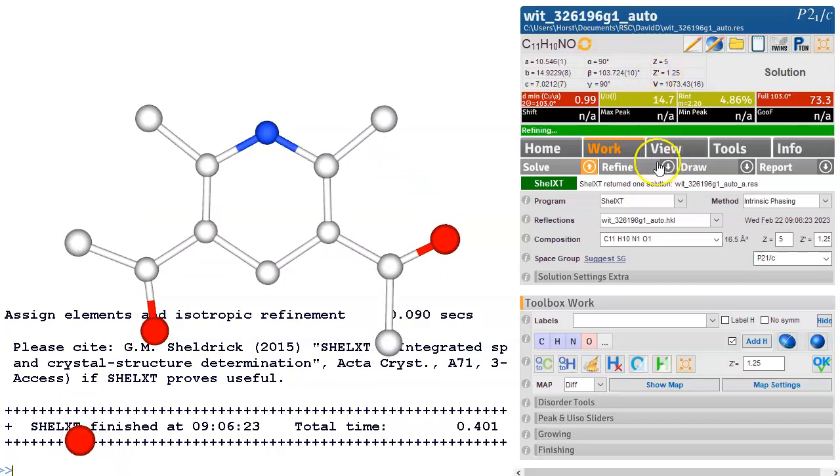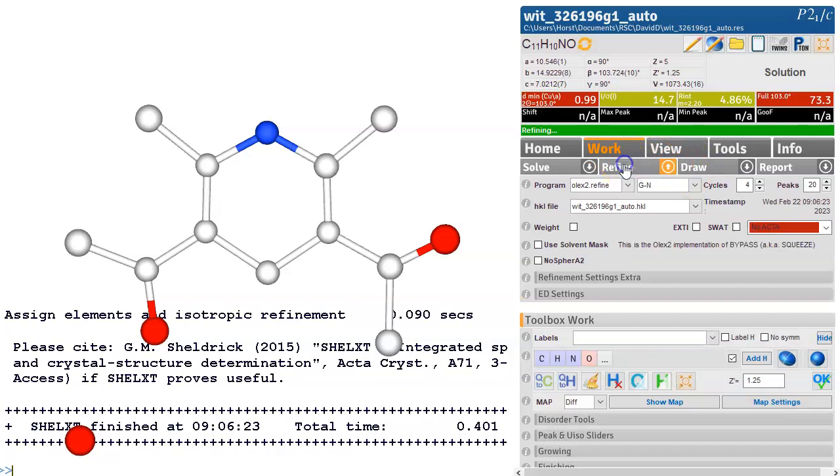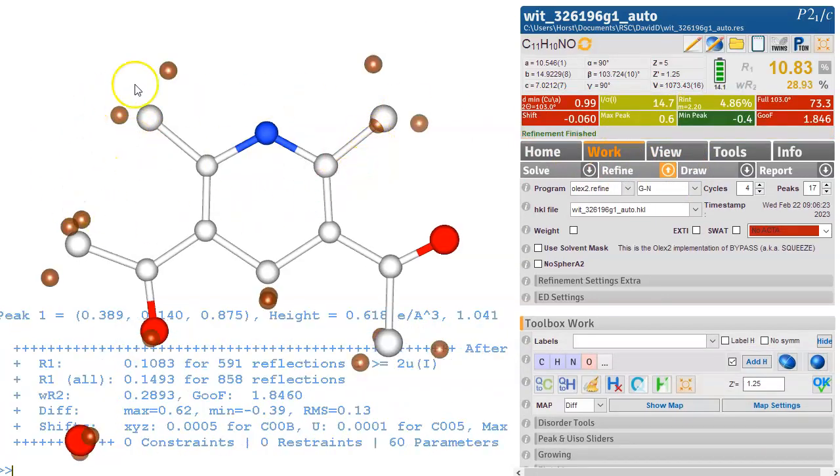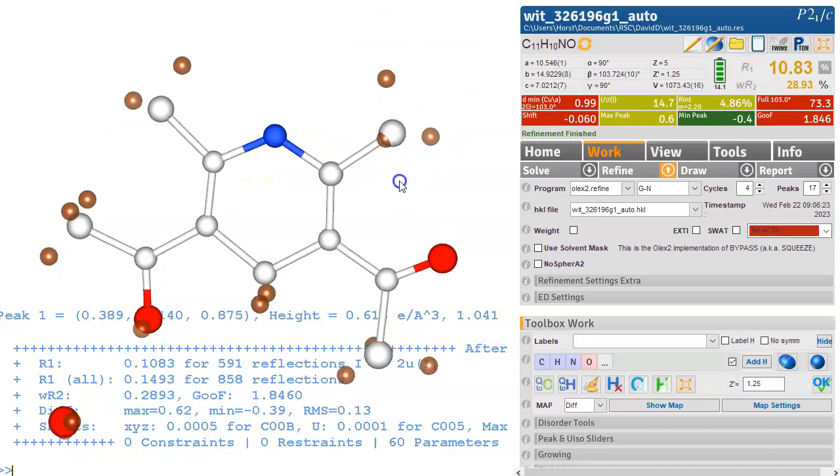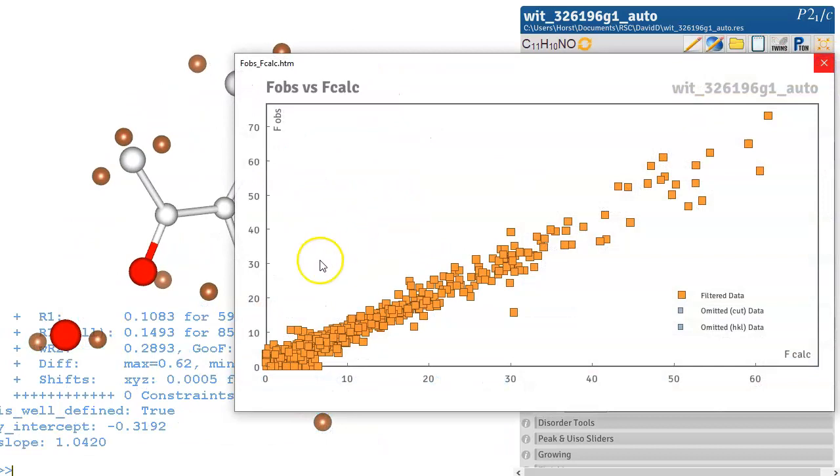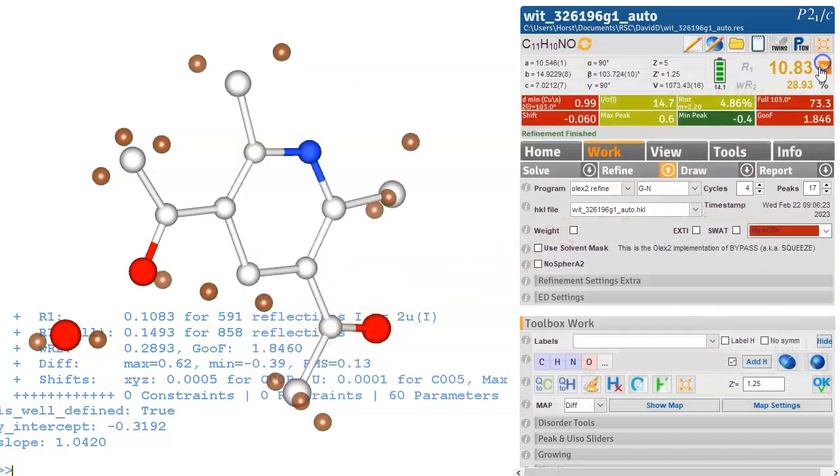And we are going to do straight away and do a refinement cycle. So we just refine it so this is the solution and now we are adjusting the positions and also the UEQ the size of these balls to fit our data. So we can look at this Fobs Fcalc plot so this is what we've calculated from our model and this is what the data tell us. So it looks quite good so there's something going on it looks like it might become a straight line when we are finished.